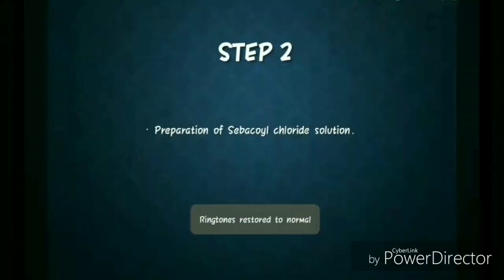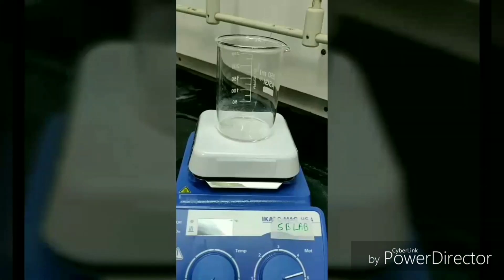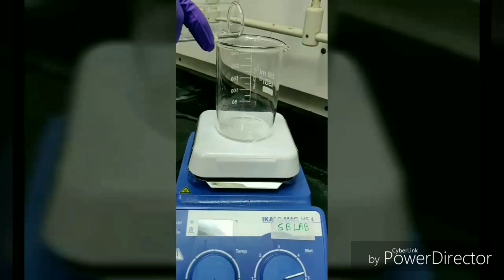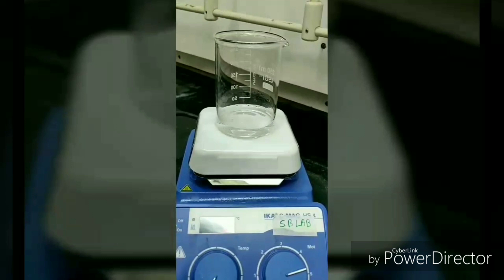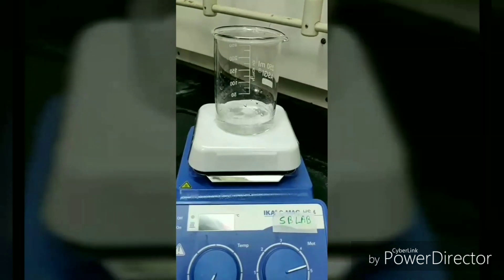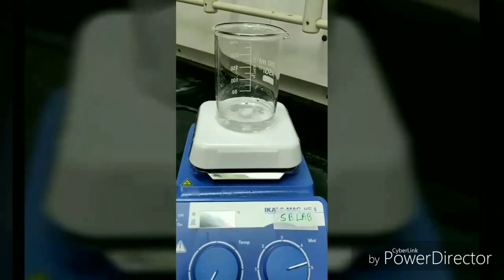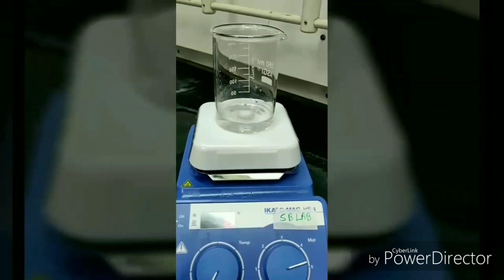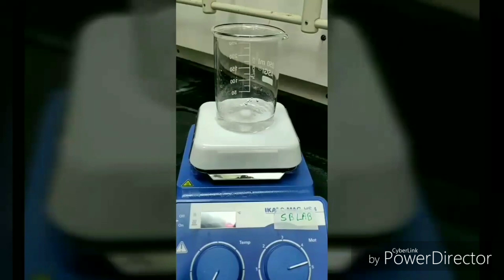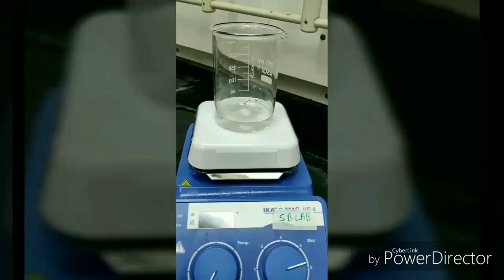The second step is to prepare a sebacoyl chloride solution. Since sebacoyl chloride is insoluble in water, we took hexane as a solvent. Switch on the magnetic stirrer to get a nice homogeneous solution.